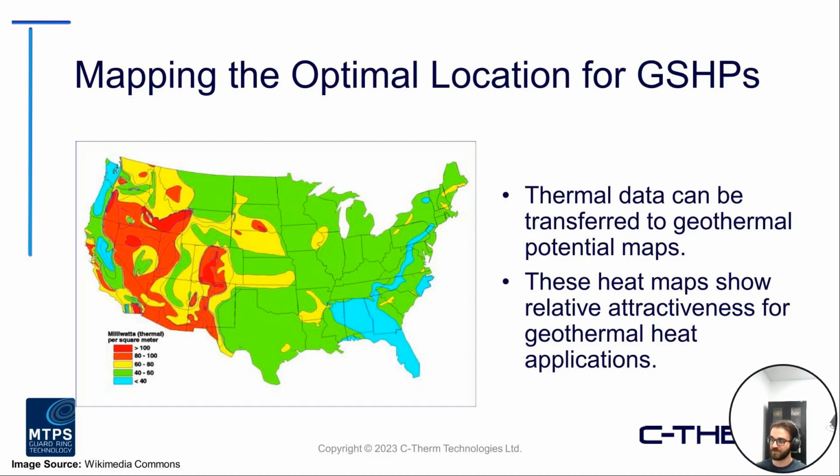And again, you may want to set up these systems, which can be quite expensive, in an area where you're going to get the most return. So again, really understanding the thermal conductivity, the thermal properties of those surrounding areas is going to be really important.